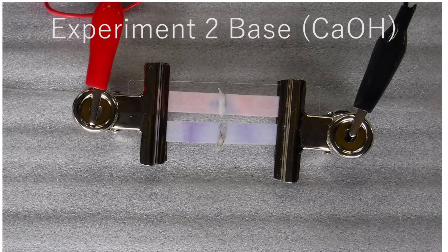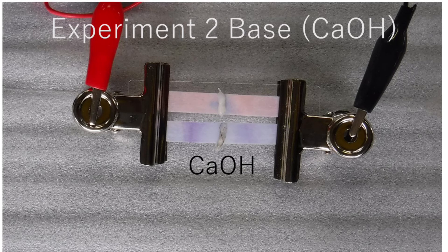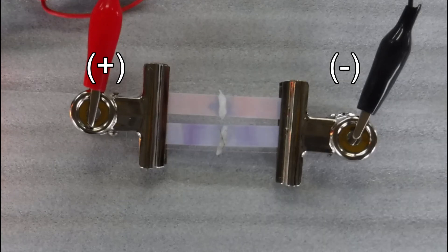Let's do the second experiment with calcium hydroxide. A small piece of cotton with calcium hydroxide is placed in the middle of the paper. The experiment is started again.